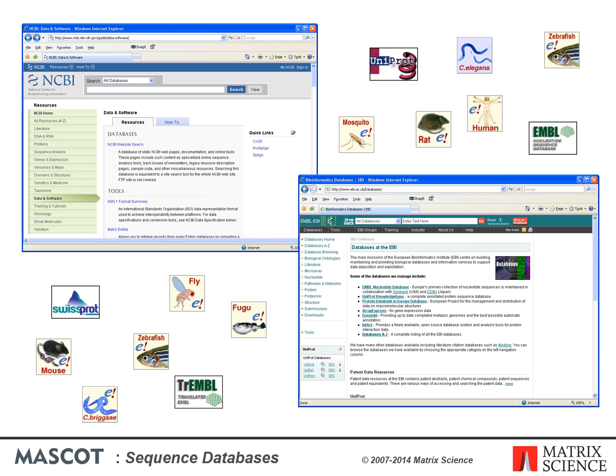Matrix Science doesn't supply sequence databases. Most databases are public domain, and there are a few sites that provide comprehensive database repositories. Two of the best known are NCBI and EBI. Here you can download NR, GenBank, SwissProt, EMBL, TrEMBL, etc. For specialized databases, such as individual genomes, you may have to track down the FTP site of the group that is doing the sequencing.